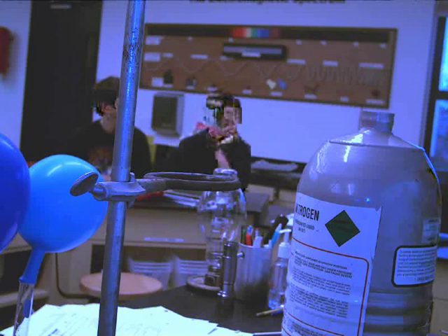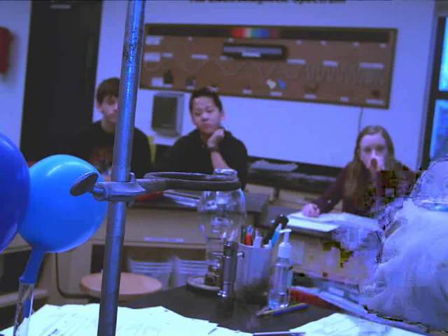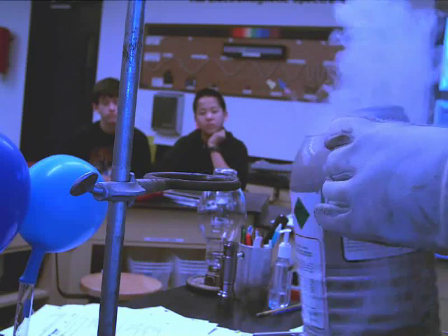So liquid nitrogen is going in the aluminum can. The white cloud that you see is not the liquid nitrogen — I'm actually pouring a liquid out. That's the liquid nitrogen. So liquid nitrogen in the can.